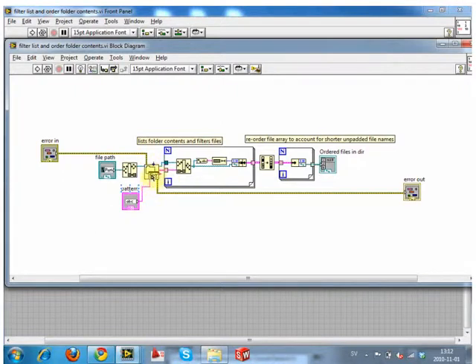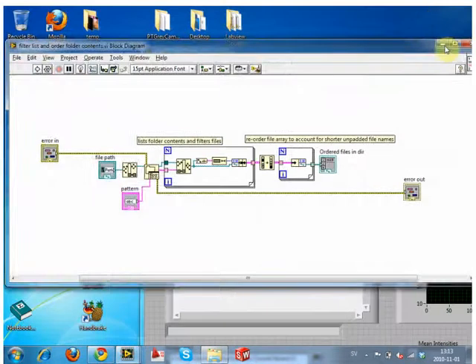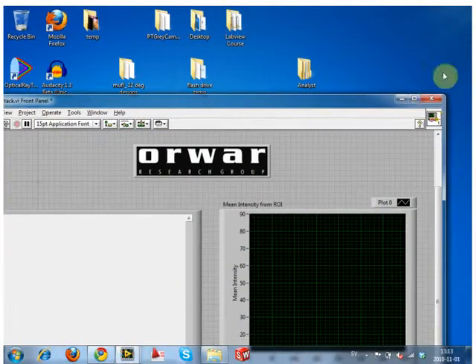Here's this low-level inbuilt older VI which lists a folder's contents. We're using that with our own particular pattern. We're feeding this in such a way that we can create our own numbering scheme for these files. One of the issues is that these files, as it lists them, are in the Windows format. So actually, maybe it's easier if I just draw on the desktop what I'm talking about.